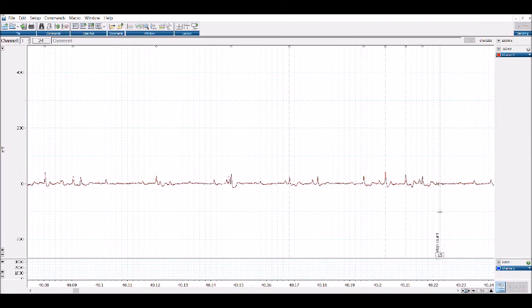And then what you're going to want to do on your key counter is take 15 and add the number that you typed of ones, and then subtract the number that you typed of twos, and then that is your final number of the number of spikes that you got in that period. So that is how you do the analysis part.